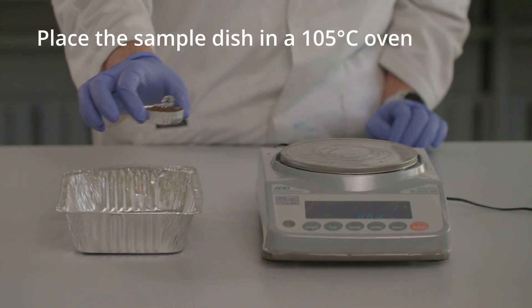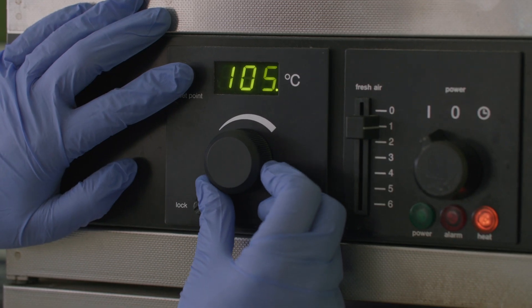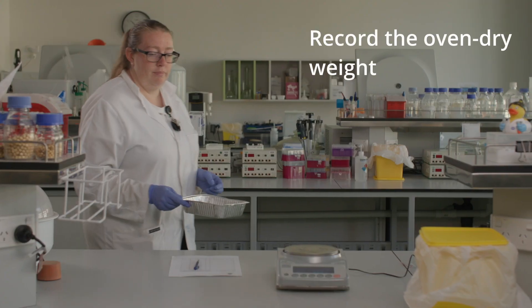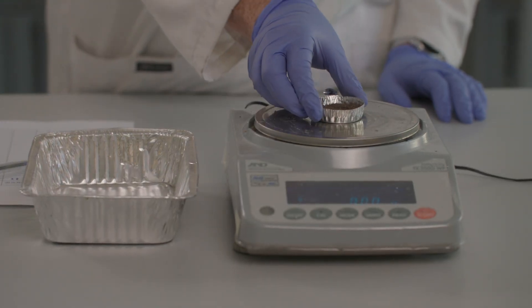Carefully place the sample in a forced air oven set at 105 degrees Celsius and leave the sample to dry overnight. Remove from the oven and immediately weigh the sample. Record the oven dry weight on the data sheet.